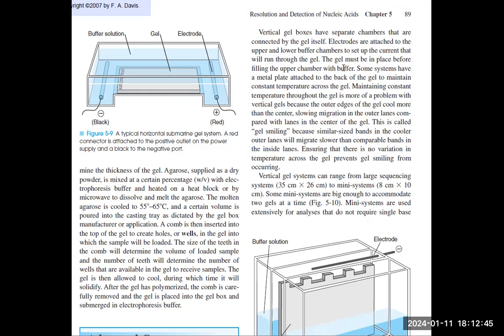So what's the rule, guys? The gel first before the buffer. Okay? So never the buffer before the gel. Always add the gel first before filling the chamber with the buffer.